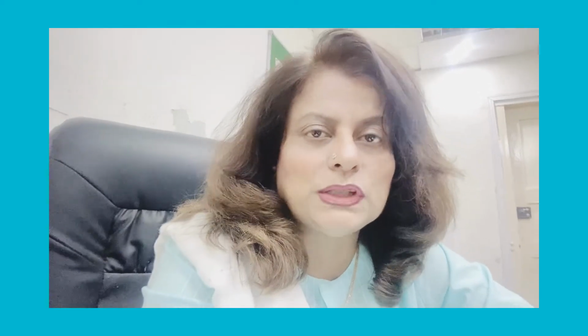And now I have seen students using this in different ways in the laboratory, and of course they know what it is, why it is used and for what reason it is used in the labs. But basically these are the glass rods and they are used for stirring purposes, and besides stirring, they are used for decanting a solution from one container to another.